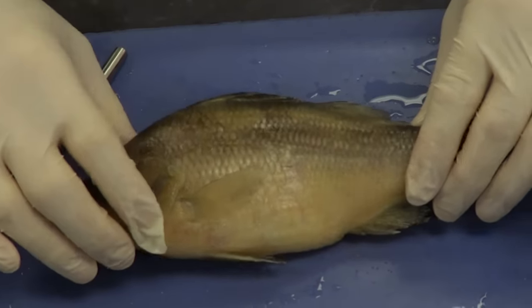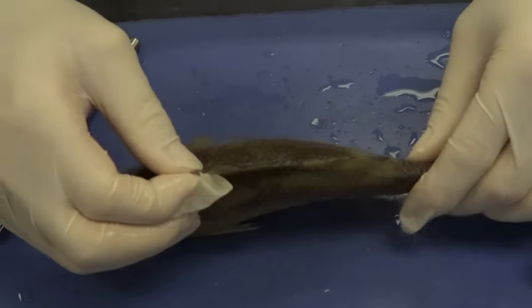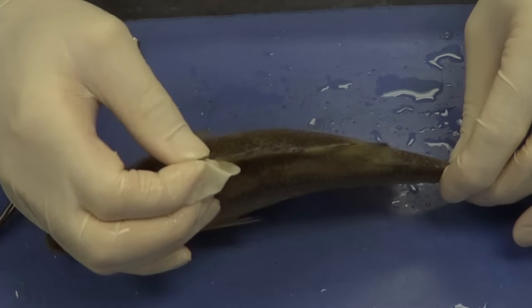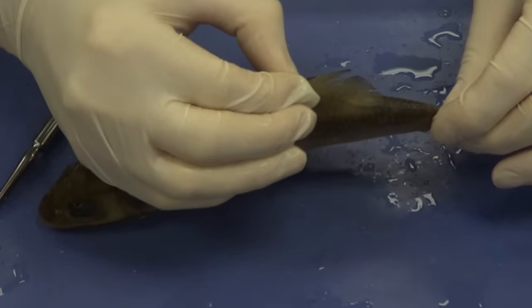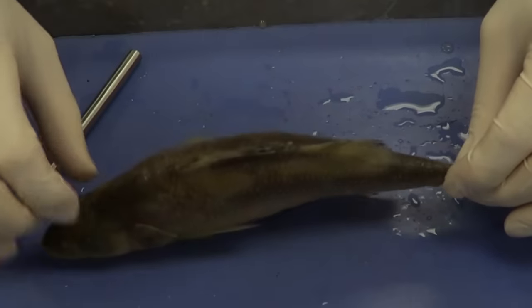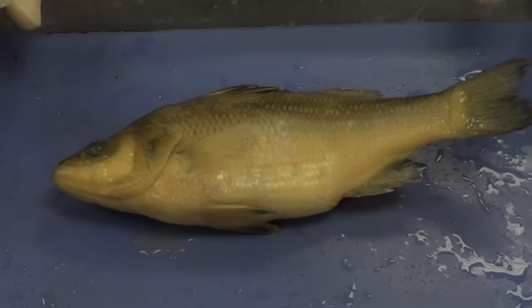On the very dorsal aspect of the fish, we see the anterior dorsal fin — be careful with it, it's got a lot of sharp bone. And then we have the very soft posterior dorsal fin, which helps keep the fish upright. These are the parts of the external anatomy.